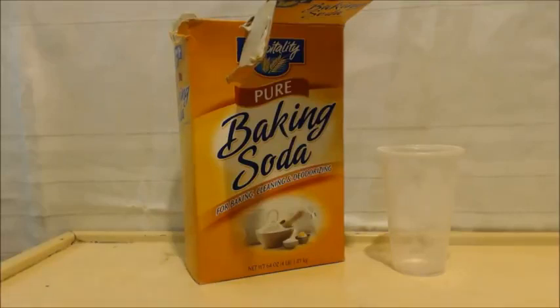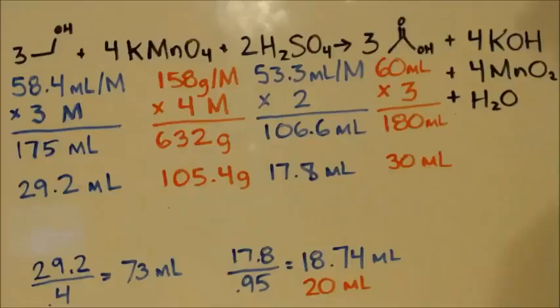I mean, this is wow. I thought that'd be impossible. This is a good result. Gives me more confidence on the aqueous one. Like I said, if you just put the pot on some ice, give it an ice bath, and make the condenser longer, you'll get a lot better yield. But I am so amazed at this.